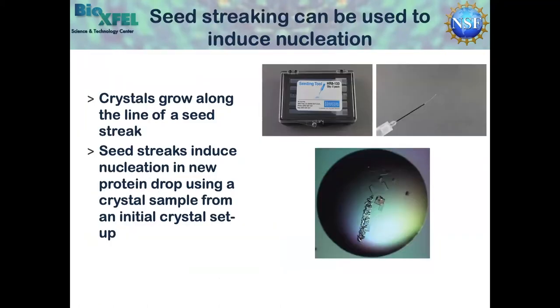As Diana mentioned: suppose you had a crystal hit that was really nice, and for whatever reason — you're doing everything the same, purifying, using the same crystallization stocks — you're simply not seeing any reproduction of your crystallization. You can use things like a seeding tool to cross-contaminate: take a small amount of your crystalline sample from your first condition, introduce a streak through your new drop that hasn't been producing crystals, and they will actually grow along the streak. This is the seed streaking approach Diana mentioned earlier, and of course it induces nucleation in the new drop by introducing micro crystals from the initial setup.